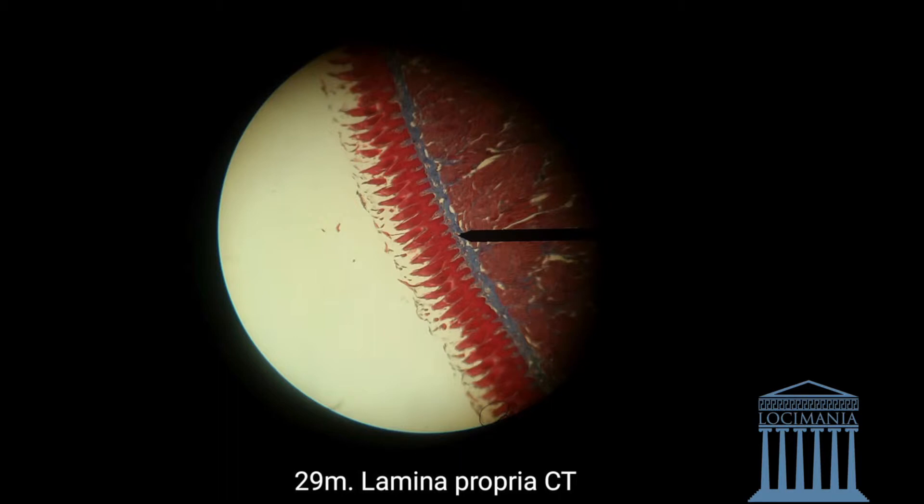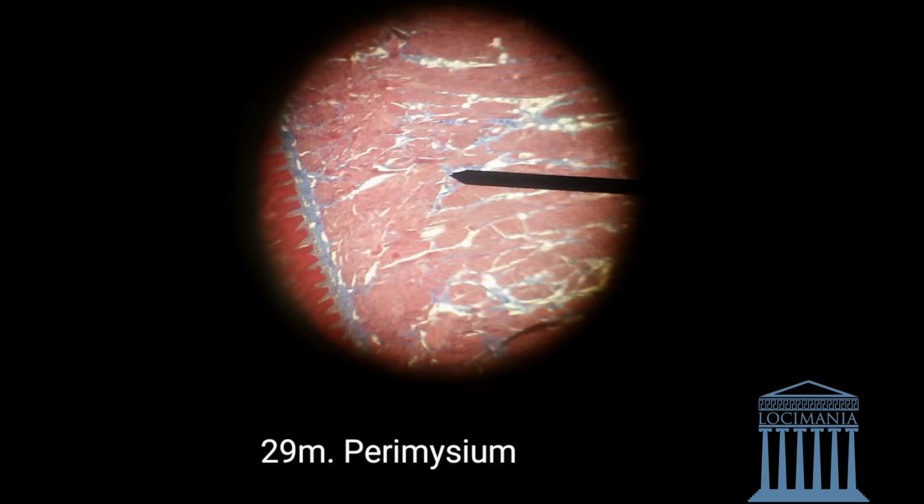We also have some blue parts around the skeletal muscle, called the perimysium. Here, the perimysium is surrounding the skeletal muscle of the tongue.